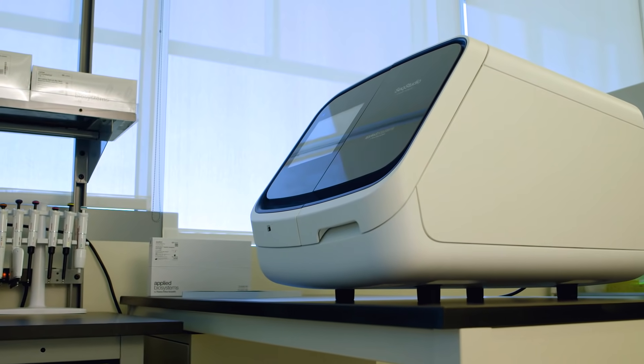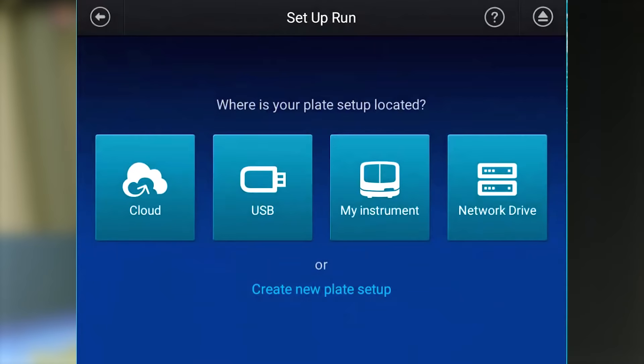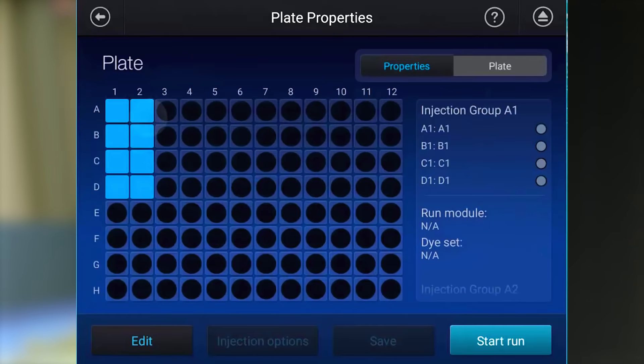You can set up your run remotely or right on the instrument. You can run both Sanger sequencing and fragment analysis samples on the same plate at the same time.